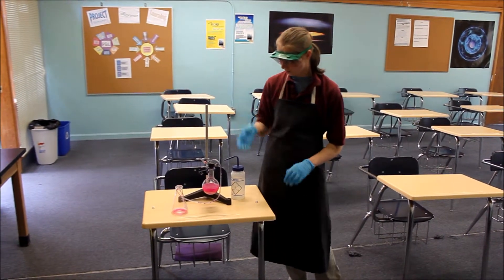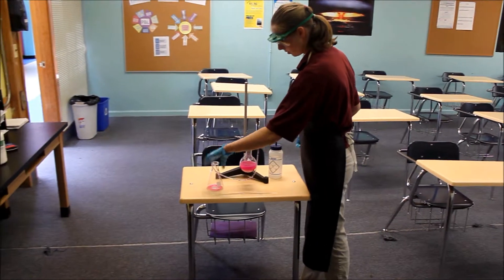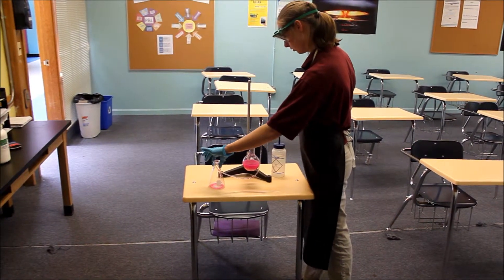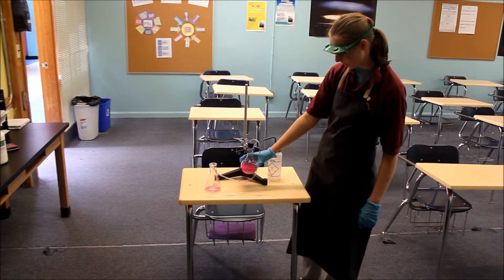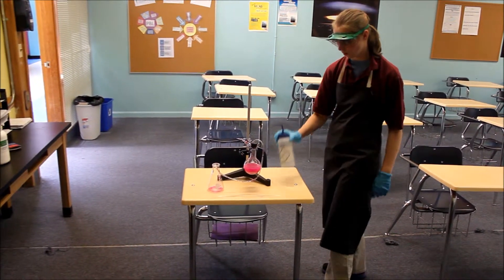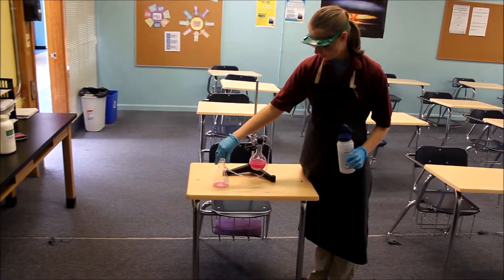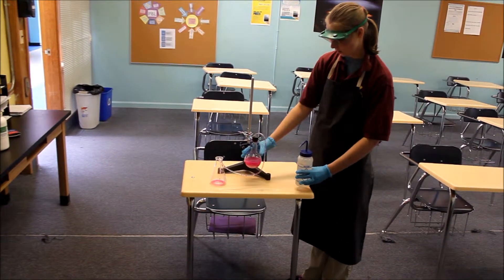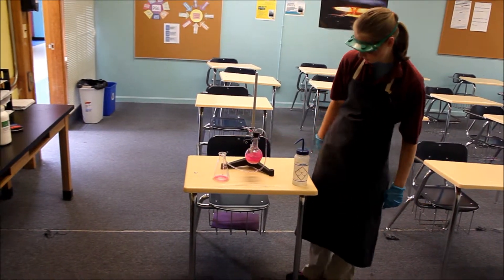The ammonium chloride and calcium hydroxide in here, when introduced to the indicator solution, causes it to turn pink. The water acts as a suction to suck up the indicator water solution into the bottle, which makes it turn pink.